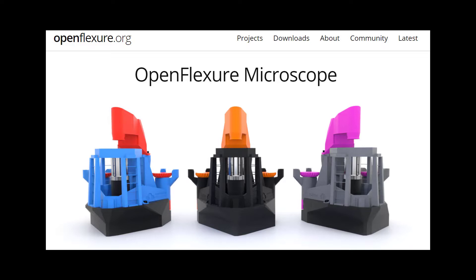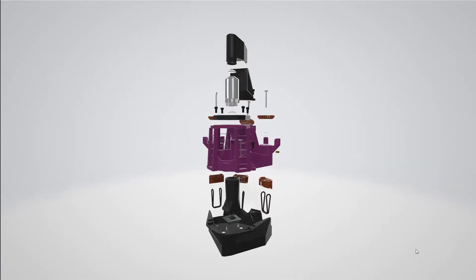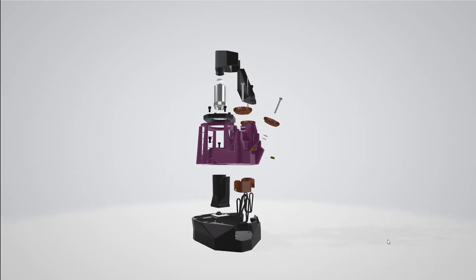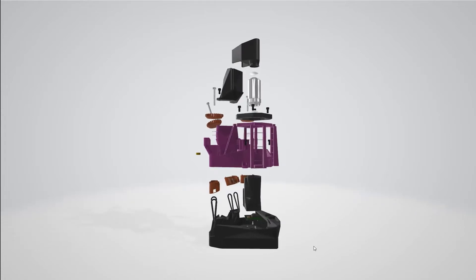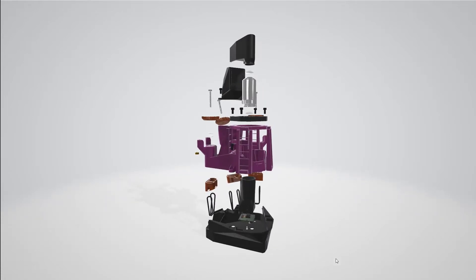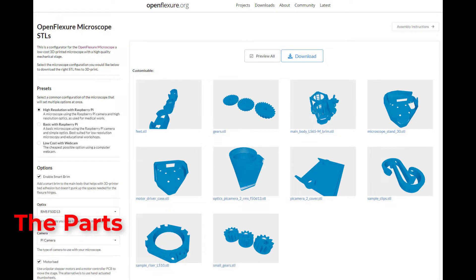The microscope we are building comes from the OpenFlexure project. The OpenFlexure microscope project is what has opened up this new world of exploration for everyday people like me. OFM is open source hardware, which means the files for 3D printing the body are free to download and print. The OpenFlexure microscope project was so inspirational to me that I started this channel to share what I learned when I built the lower magnification version of this microscope. The OFM website has a great tool for selecting the right set of 3D models you need for the kind of microscope you plan to build.